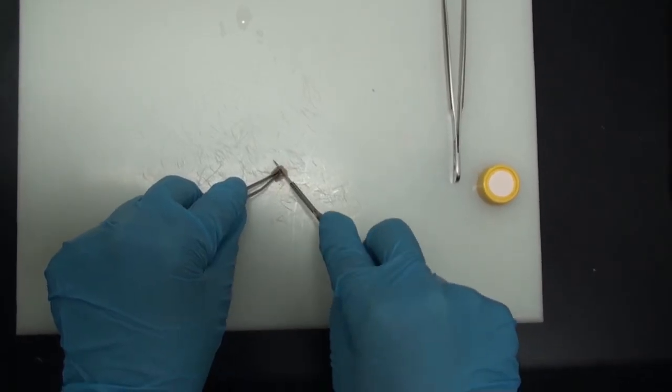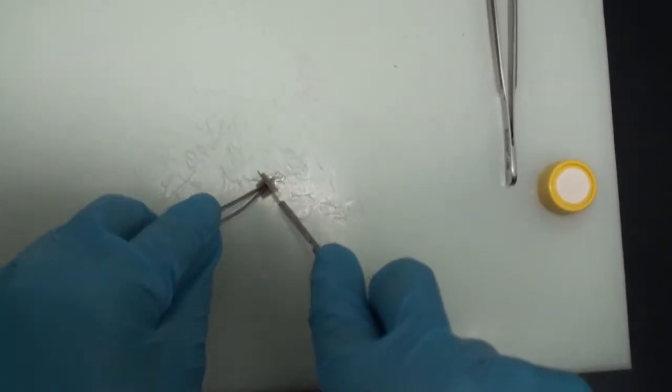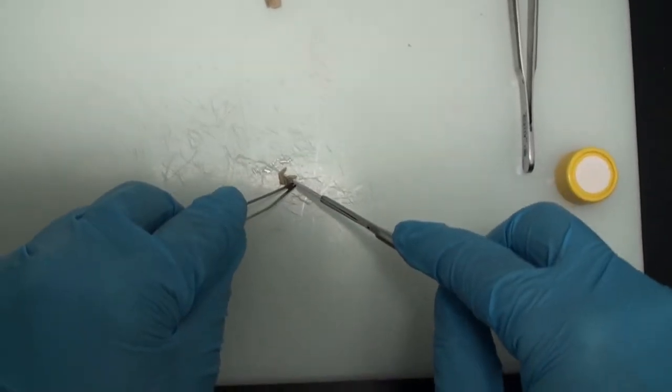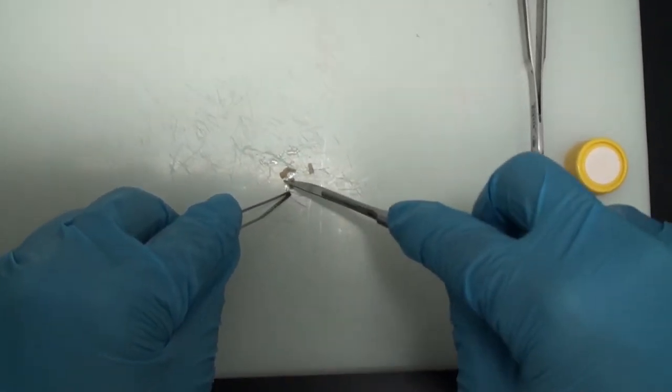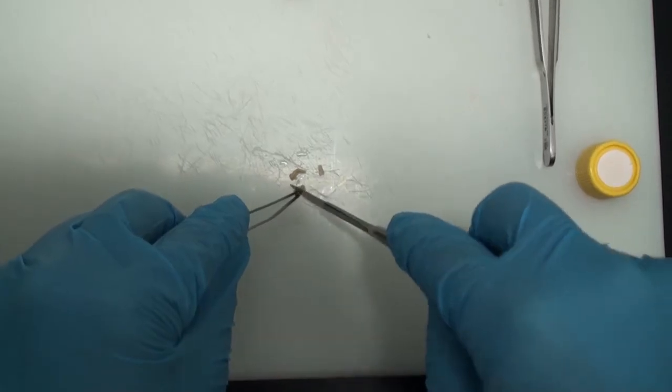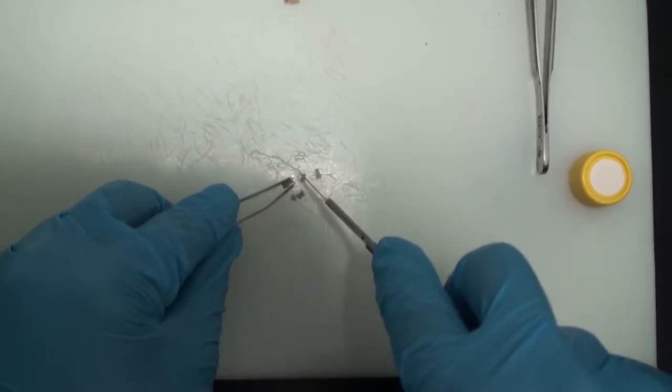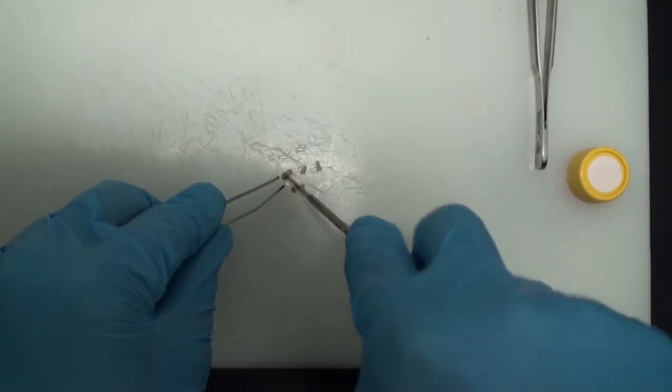First, we are taking the sample and doing what we call the grossing, which means getting smaller sections of our sample to do the processing. Note that the sections we are taking are extremely small.